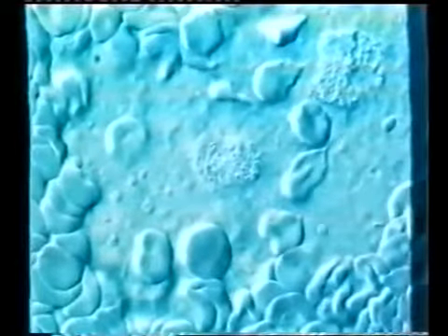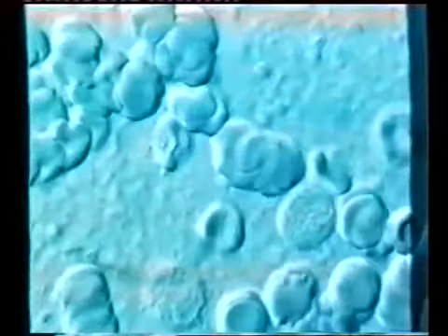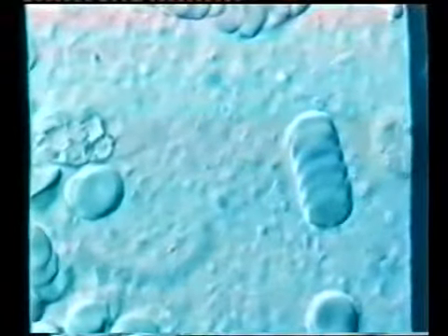Consequently, it is not enough to take a short look at the blood in the microscope to find this incredible, amazing particle activity in a capillarily received blood drop. It is necessary to analyze the whole thin blood layer between a microscope slide and a cover glass, and then these structures can come into sight.